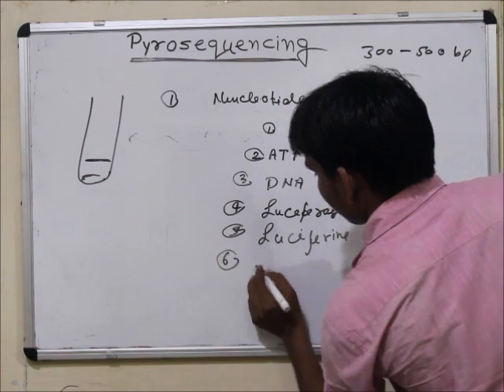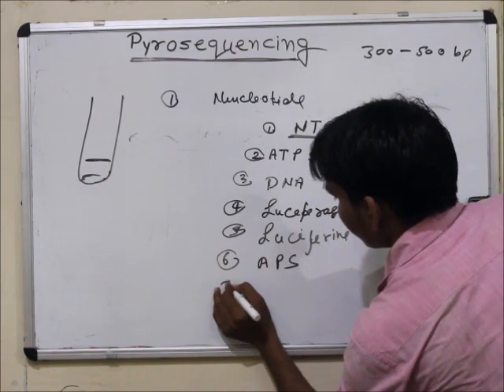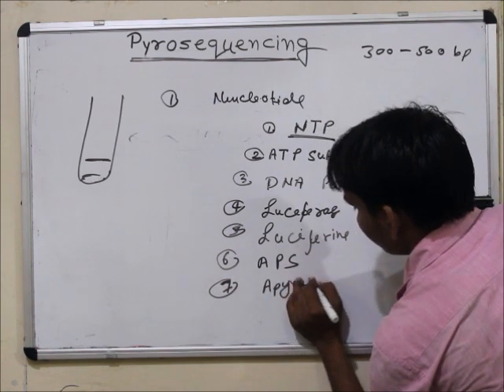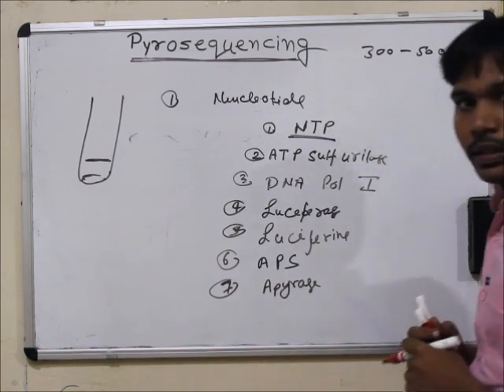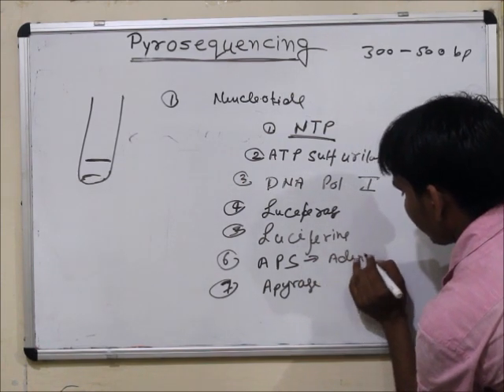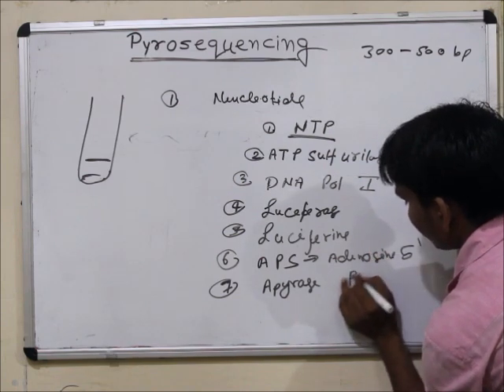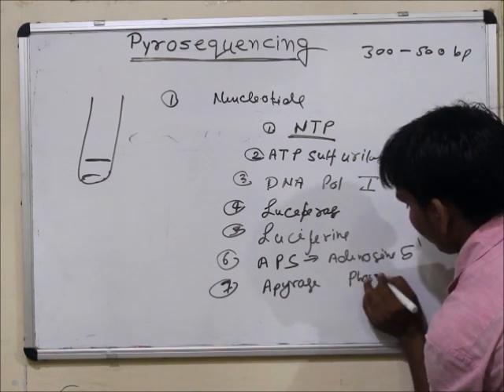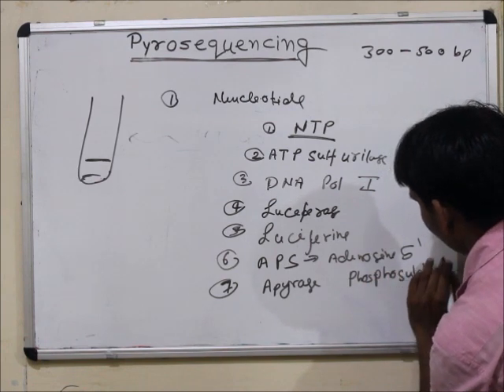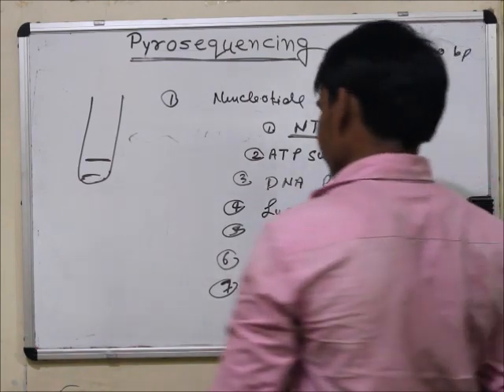Sixth is APS, adenosine 5'-phosphosulfate. Seventh is apyrase.